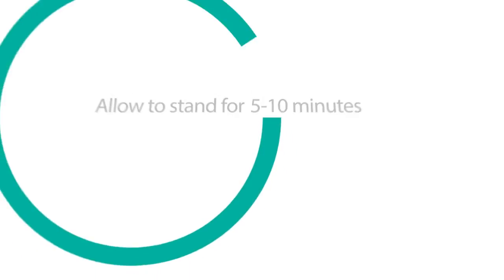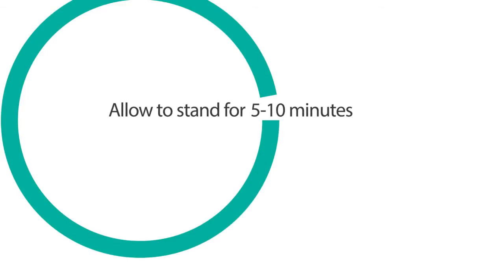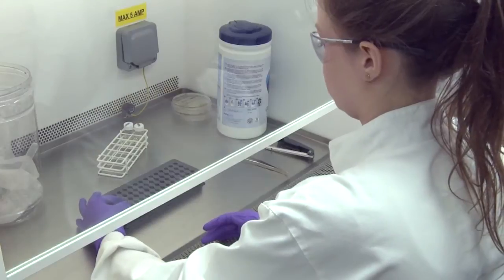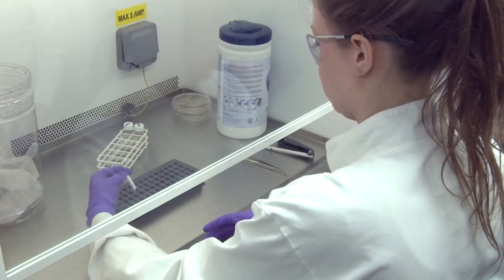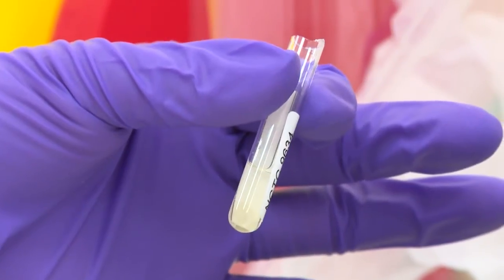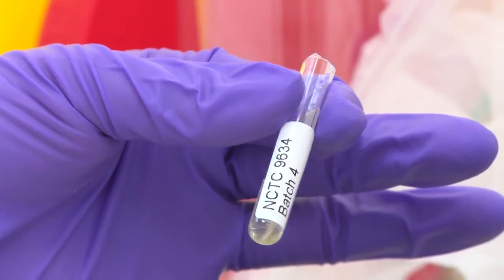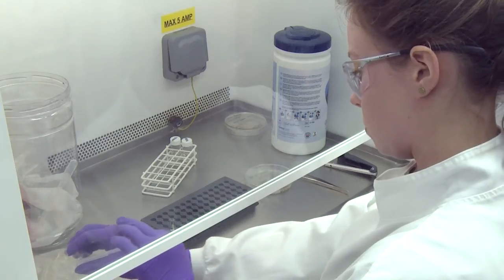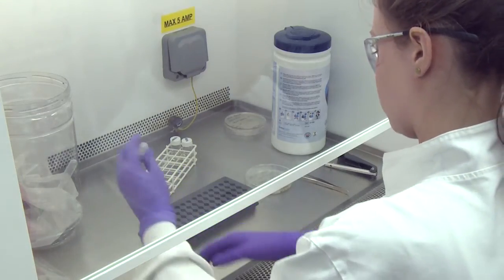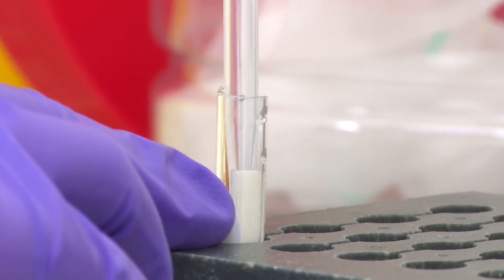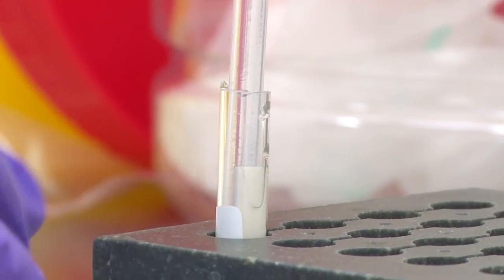Allow to stand for five to ten minutes to ensure that the content has rehydrated. Check to ensure all material has been dissolved. Gently re-suspend the reconstituted content to avoid frothing or creating aerosols.